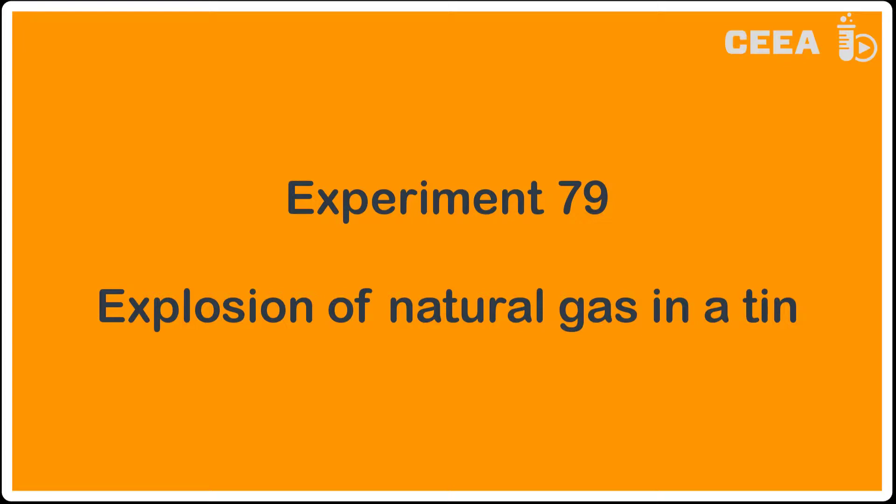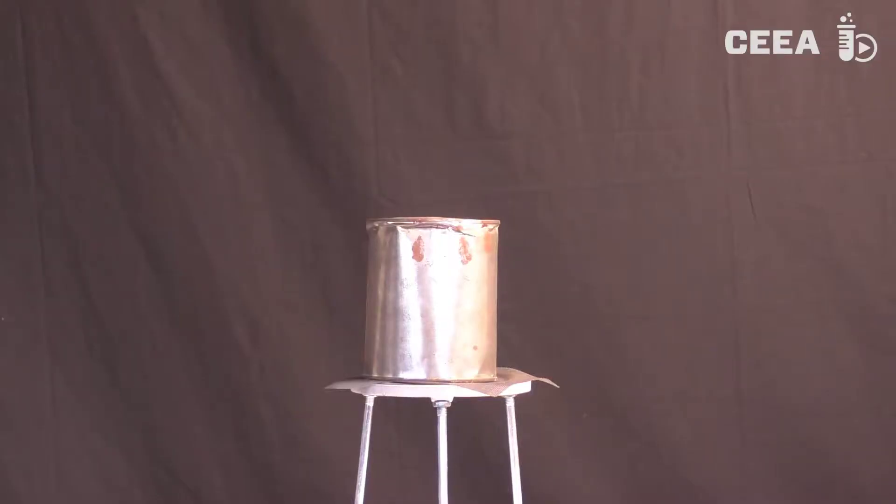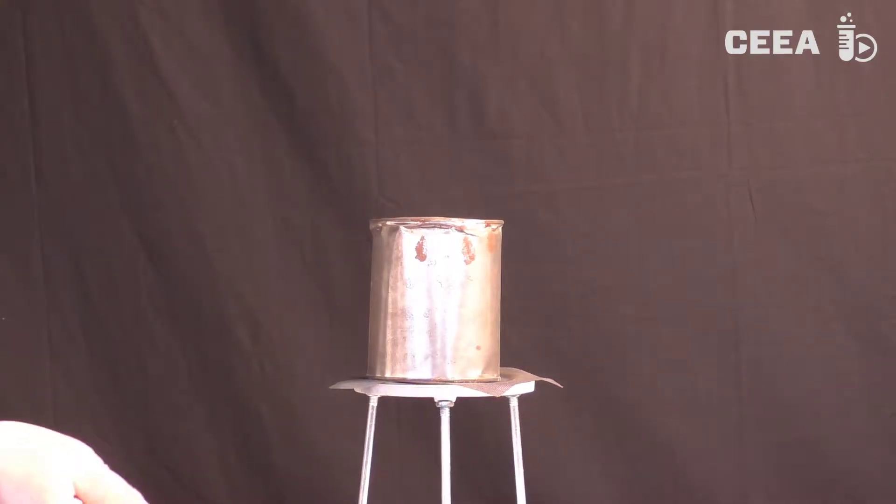Experiment 79: Explosion of natural gas in the tin. In this experiment we show that the combustion process of natural gas, in this case methane, does not always proceed in a controlled way.